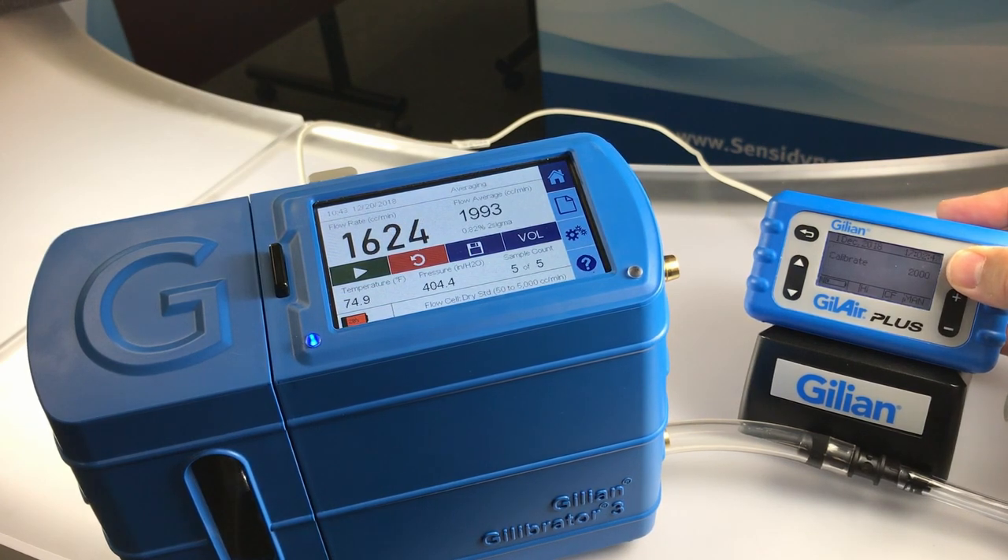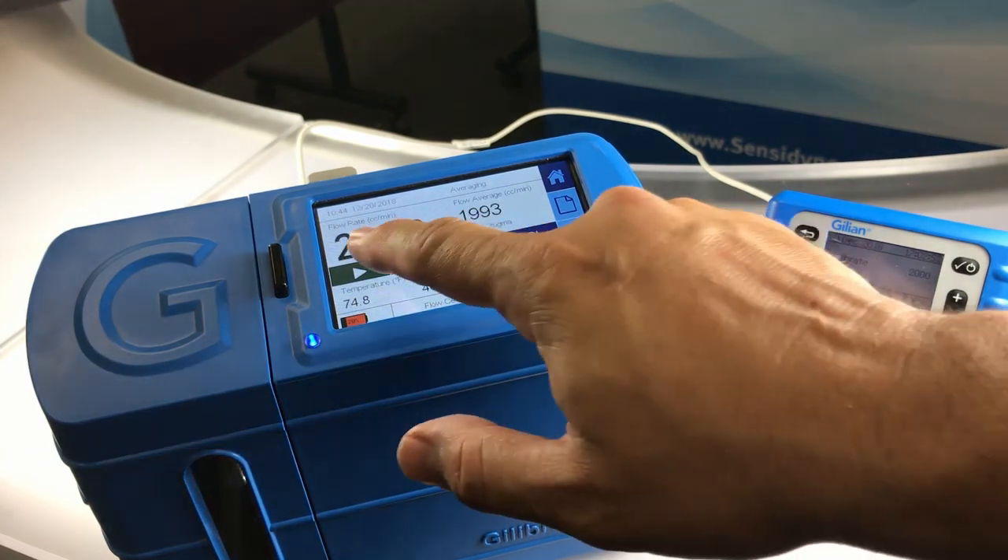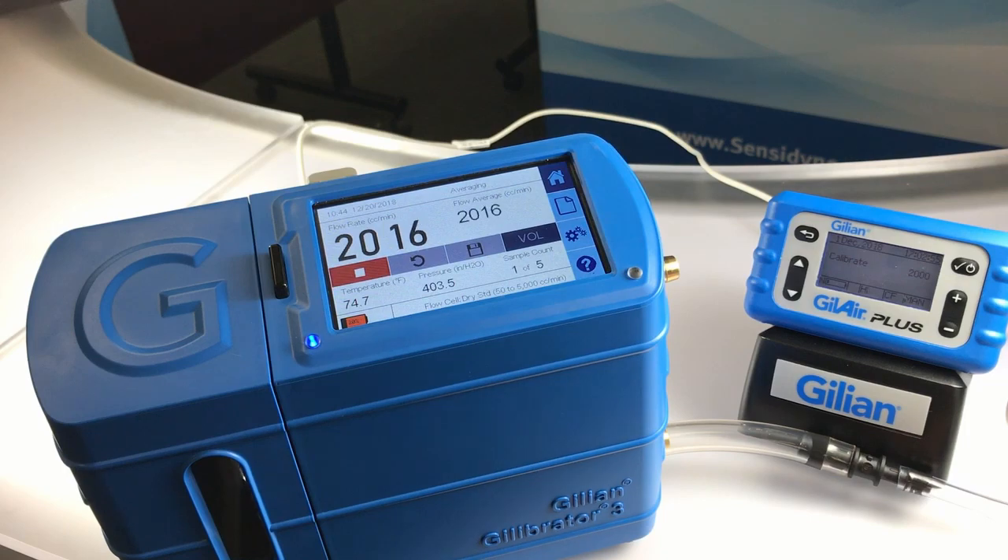You will notice that the flow rate will now appear in your Gillibrator 3. Once you see that it stabilizes, hit the play button to begin the SmartCal process.